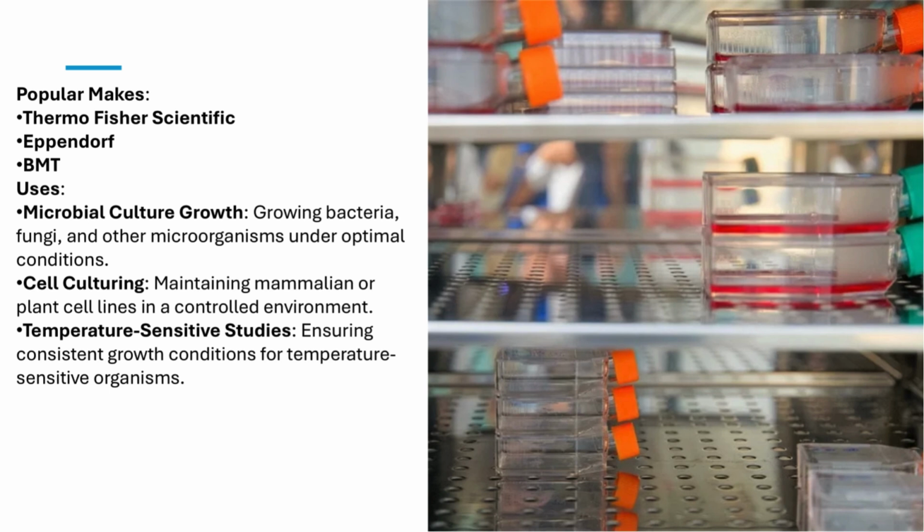Some of the top brands that manufacture incubators include Thermo Fisher Scientific, Eppendorf, and BMT. These brands are known for their high quality and reliable equipment, trusted by labs all over the world. Incubators are used for a variety of tasks in microbiology labs. Here's how they're put to work in everyday research.